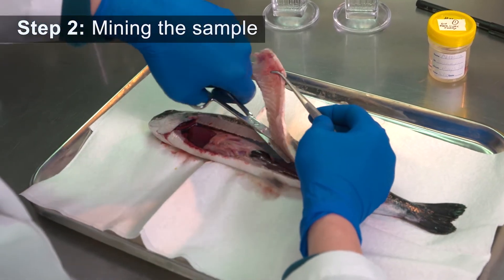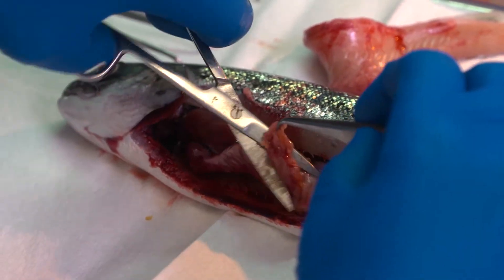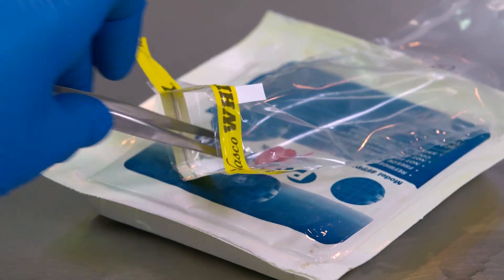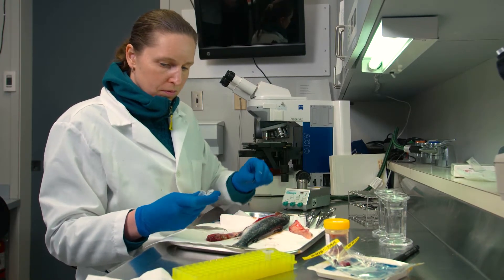Different parts are retrieved from the fish sample for a series of lab tests. First, the pyloric ceca are removed — that is the part of the fish that secretes digestive enzymes for nutrient absorption. Other tissue samples are then removed, including the liver, stomach, and kidney.